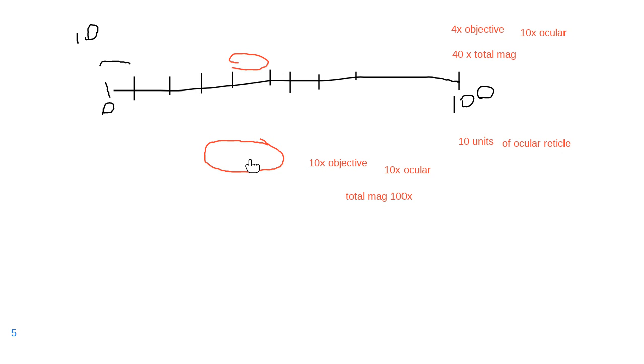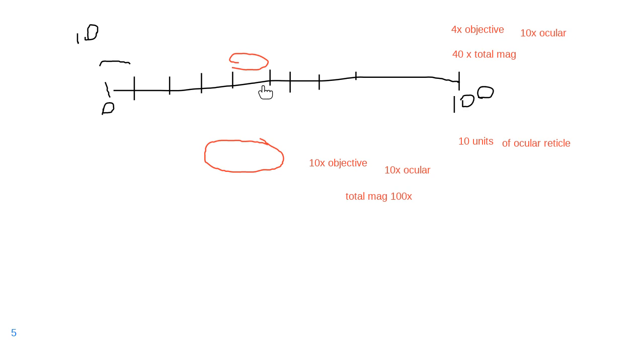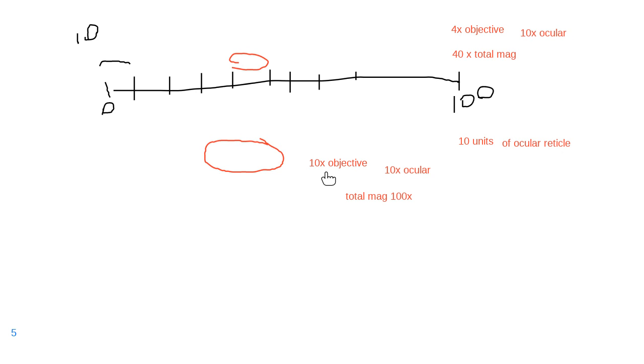So when you are using a larger objective, it's going to spend more units of your ocular reticle. So if you said, I'm going to assume that each tick mark is one micrometer, then my sample here spends 10 tick marks, so it's 10 micrometers. And then when I move my objective, if it still measures 10 micrometers, suddenly my sample grew, and now it's 250 micrometers long, which it didn't. Because it looks bigger, but it's still the same size.